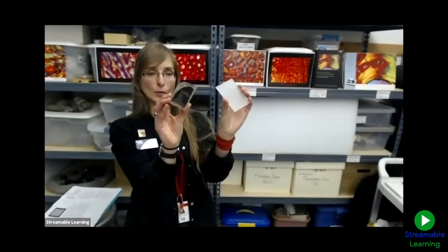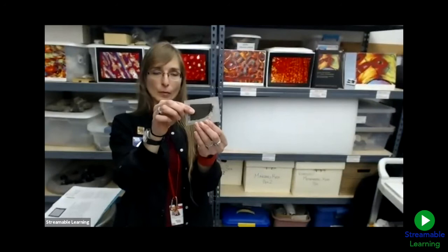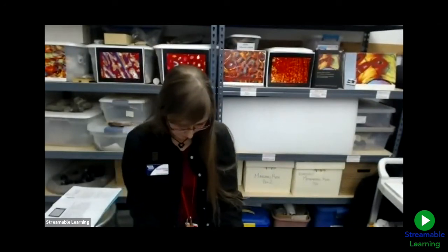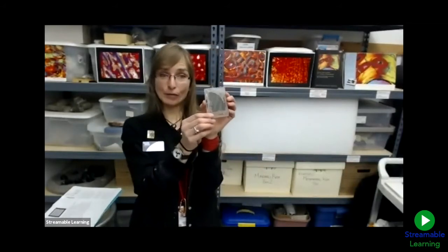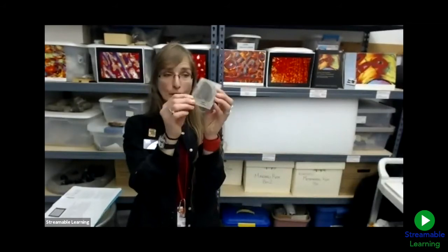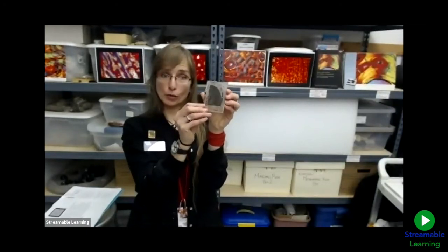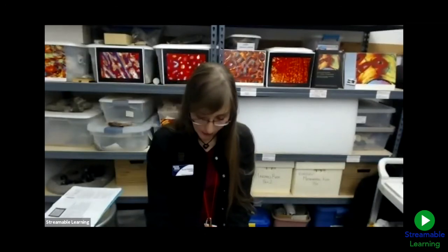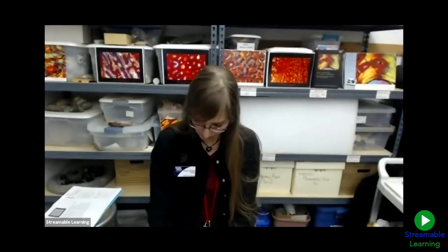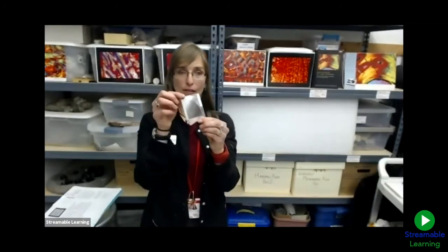That thin slice is then mounted onto a frosted glass slide with epoxy glue. And then I spend many happy hours grinding and polishing this full specimen, full wafer, mounted to the slide, down to that final thin section slide, which you saw earlier. So another question to think about: why do we mount it in plastic resin? And I'll check in with Angie as answers come in. And again, this is our final thin section slide.